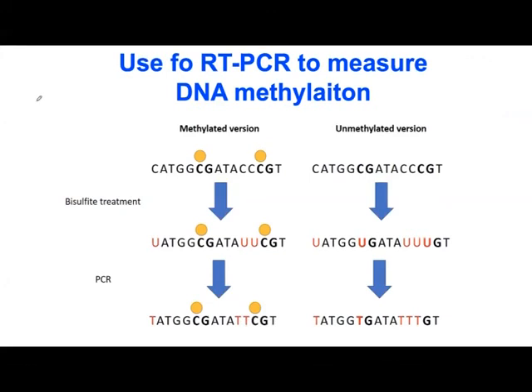And the last thing I want to finish with is that some people are interested in epigenetics, like looking at methylated DNA. Again, with methylated DNA, before the start of the real-time PCR, you need to do what is called bisulfite treatment. Any cytosine which is methylated will be protected. It will not be changed. A cytosine that is not methylated will become a T at the end of the day.